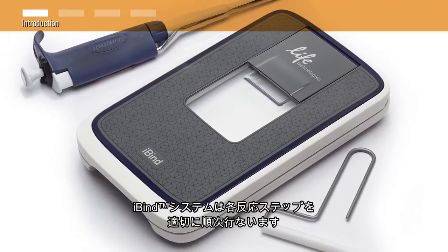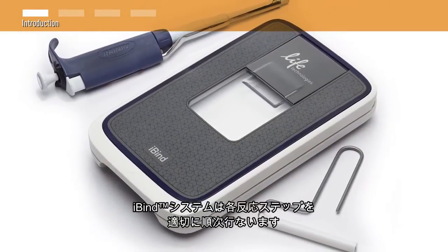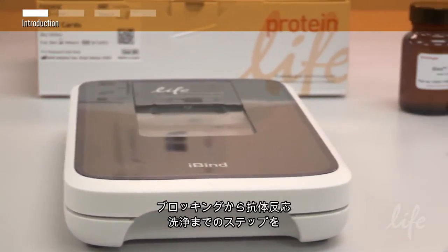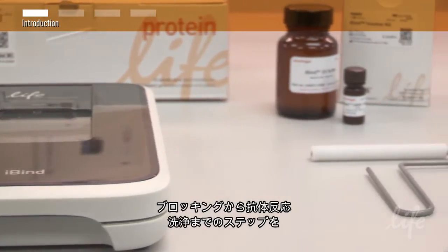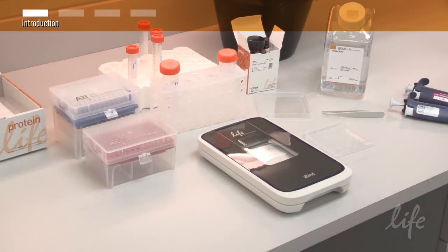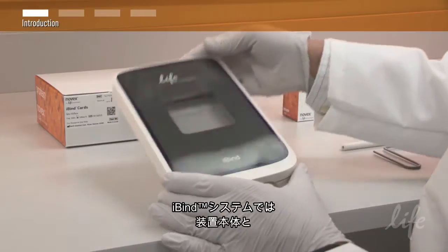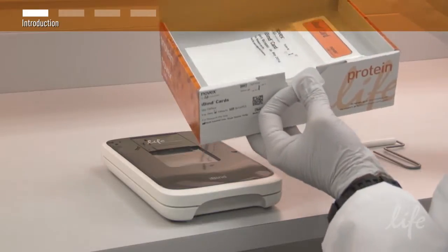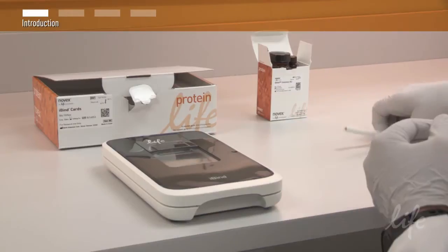The iBind Western system performs all immunodetection steps in a seamless sequential process. Blocking, primary antibody, secondary antibody, and wash steps are sequentially automated in a fully walk-away technique. The iBind Western system comes with an iBind device, iBind cards, an iBind solution kit, and a roller.